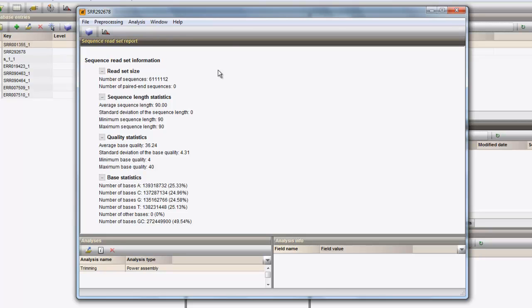On a more detailed level, it is very interesting to consult the predefined charts by clicking the second button.